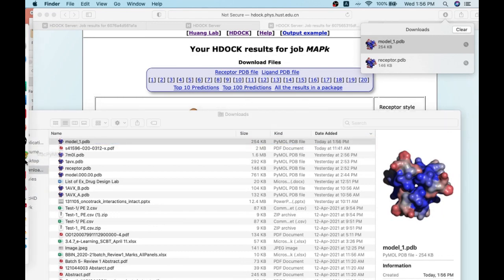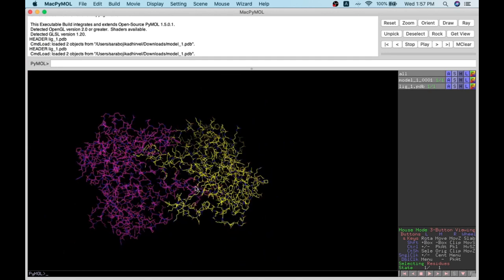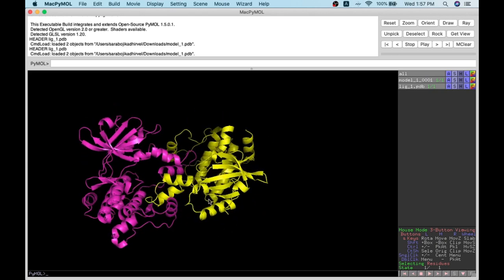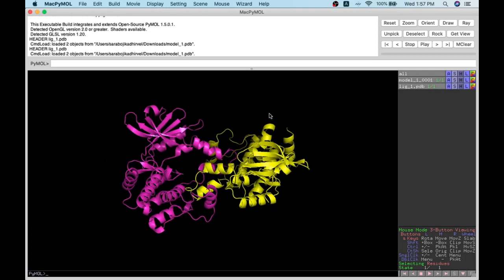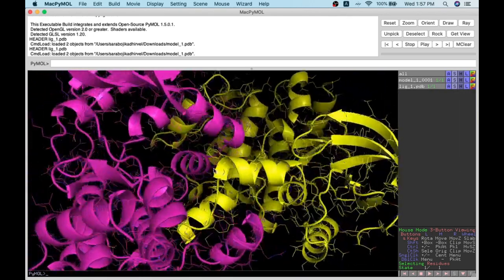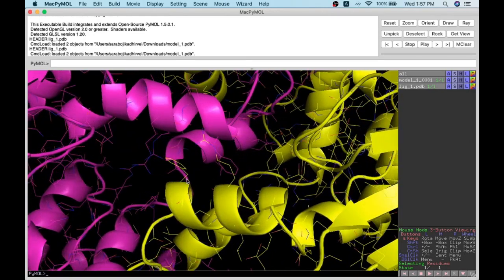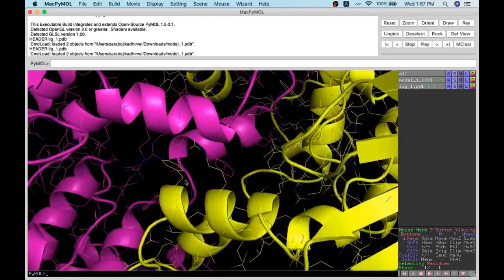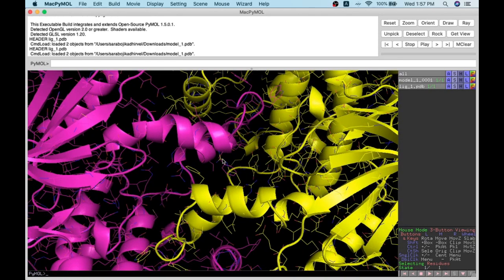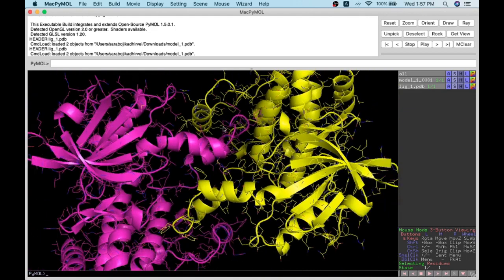Here I use PyMOL to visualize the docked complex — this is model 1, the conformation obtained. I can show the cartoon representation to see how beautifully they are interacting. If you want to look at the interacting residues, you can display the lines as well. If you zoom in, you can see the interacting residues, and the monomers are packed in a compact arrangement in this docked pose.